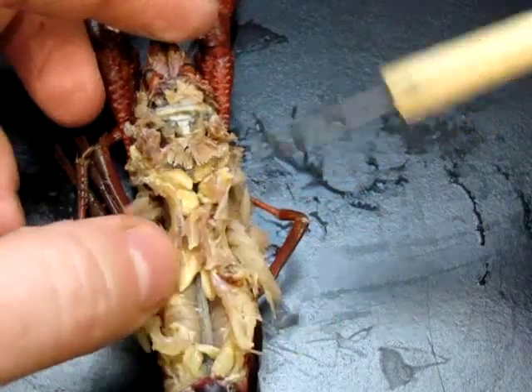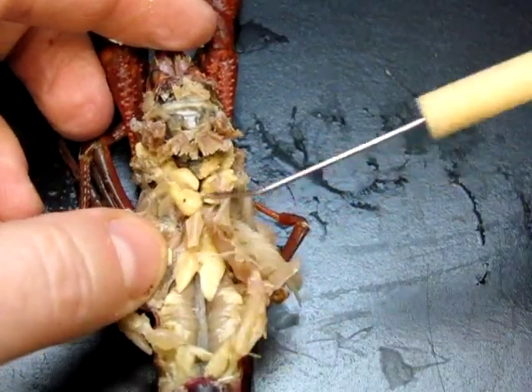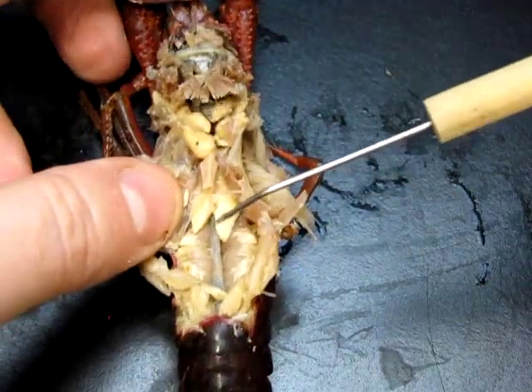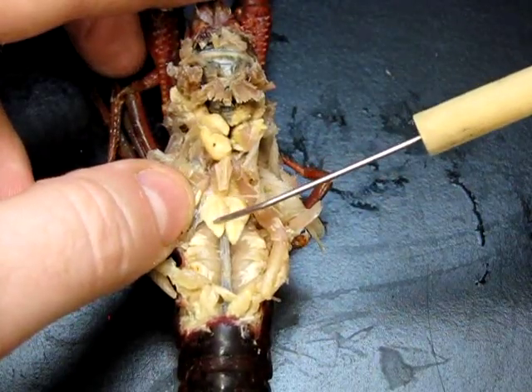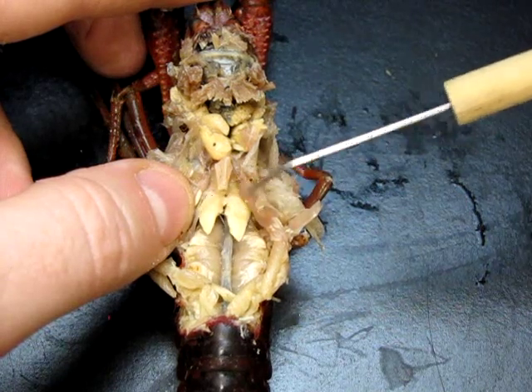A few other things we can see: this is a male animal, so we can see its reproductive organs — the testes. This lobe here and this lobe here are the testes, the site of sperm production.